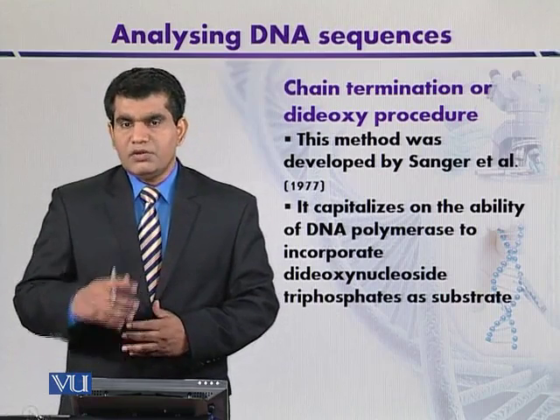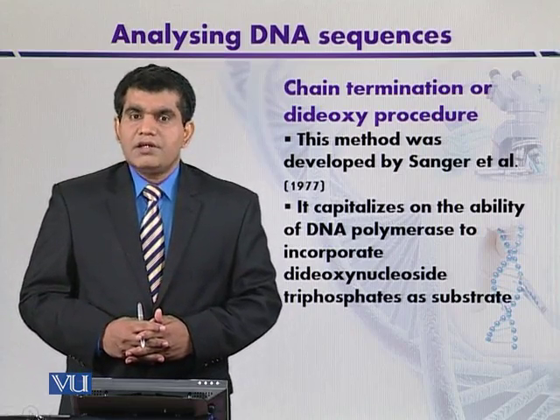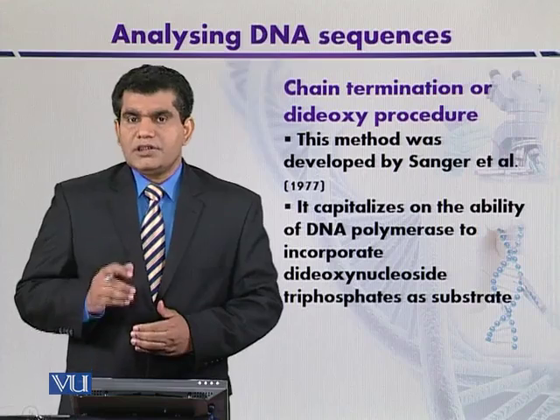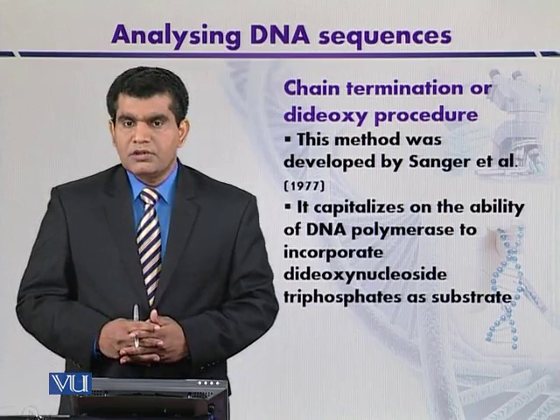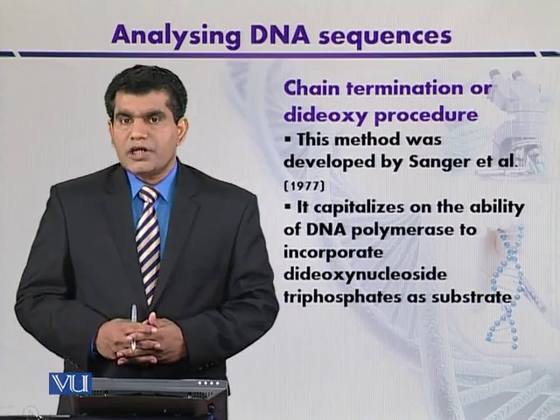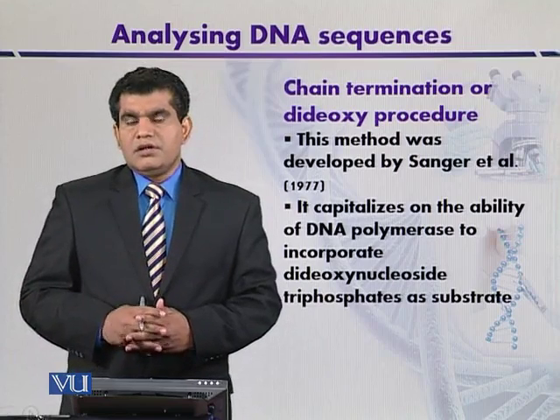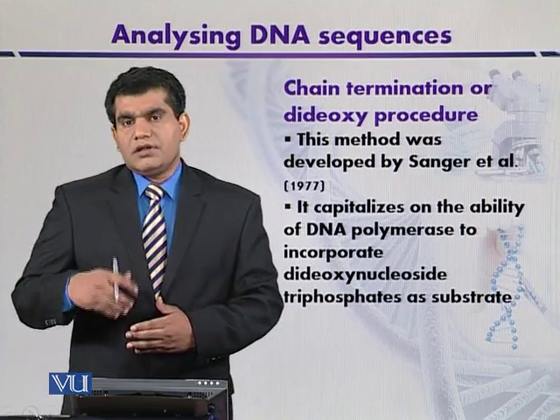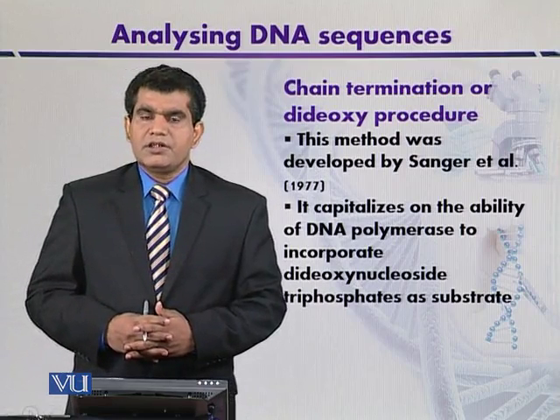So this modified base can be used as a substrate and inserted during the elongation process. But as soon as it is inserted, the further addition of nucleotides is stopped. The reason is that at the 3' position of dideoxynucleoside triphosphate, the OH group is missing. That will not catalyze the next reaction. Because of this, in the newly synthesized DNA fragment, the addition of new nucleotides is stopped.